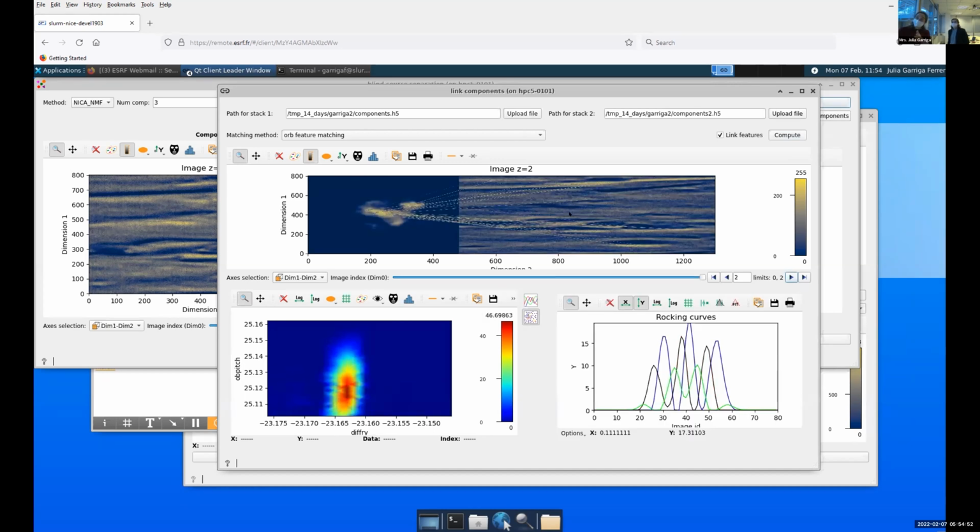And with this, look, it found something. Yeah. Although it's not good, just so you know that sometimes it can get it wrong. You can also change here a different option. I think the shift for now is not working, but you can also use the Euclidean distance. Yeah. And Euclidean distance is very useful, for example, when you're trying to find a feature that has changed. So it's a feature that changes along the dataset, but is more or less in the same position, for example.